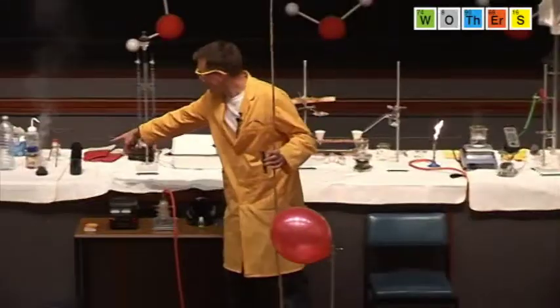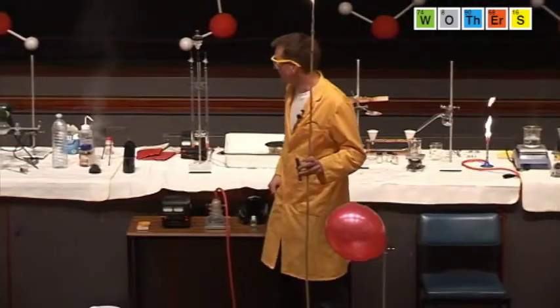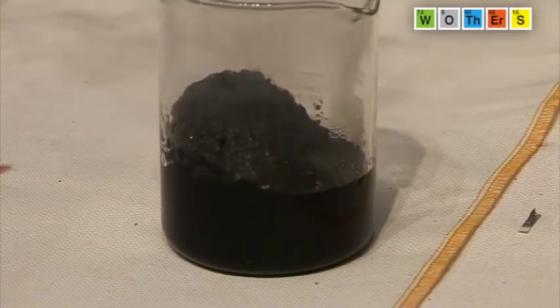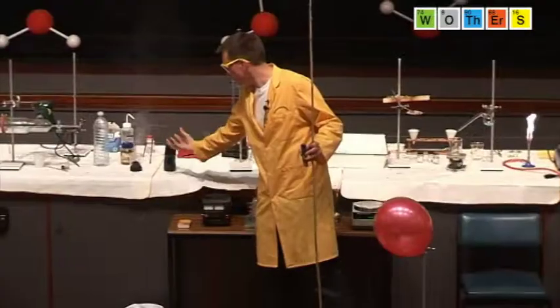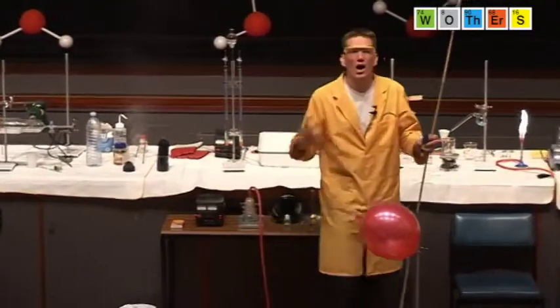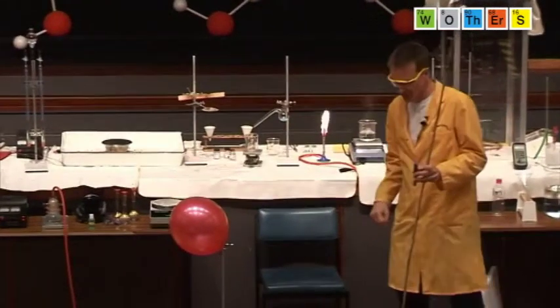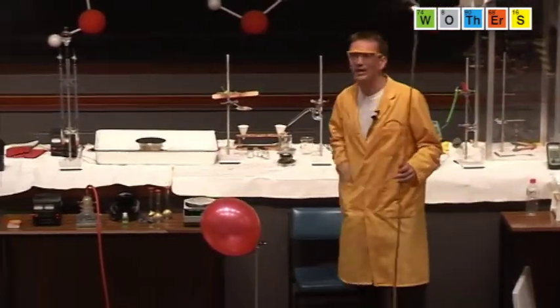Notice our sugar is beginning to react quite vigorously there. Okay, there's actually a lot of heat being formed from this reaction, and that's creating steam, which is causing some of the bubbles and the carbon there that's forming to rise up. But anyway, so that's the sugars being dehydrated. Anyway, back to our gases.